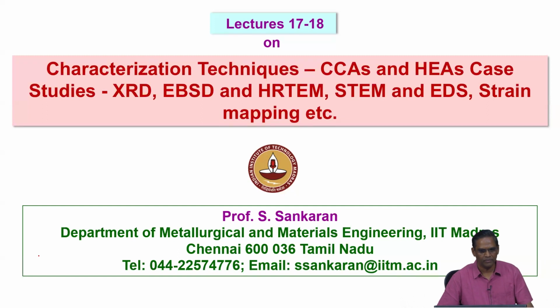Yeah. So we start with X-ray diffraction for crystallographic identification or phase identification, optical microscopy for overall microstructures at very low magnification. And then you do some SEM and EDS for topography, secondary electron image or backscattered image, or you use phase specific diffraction techniques like EBSD. These are all phase specific diffraction techniques.